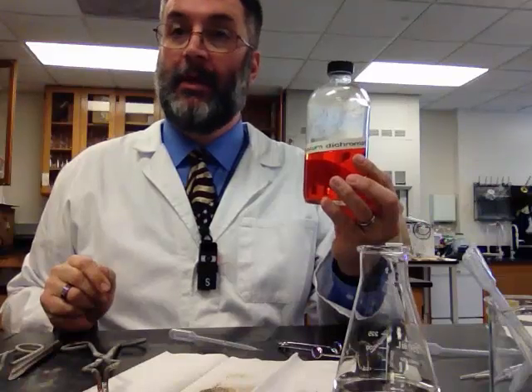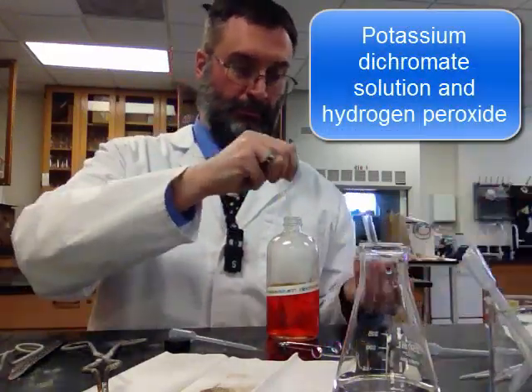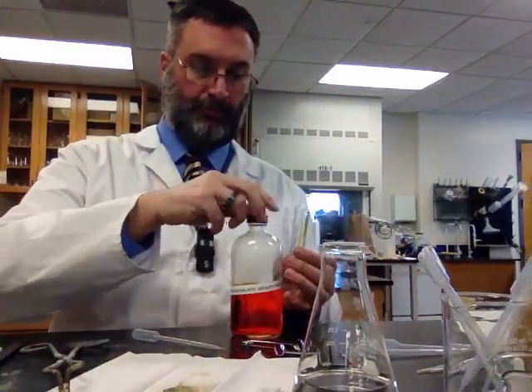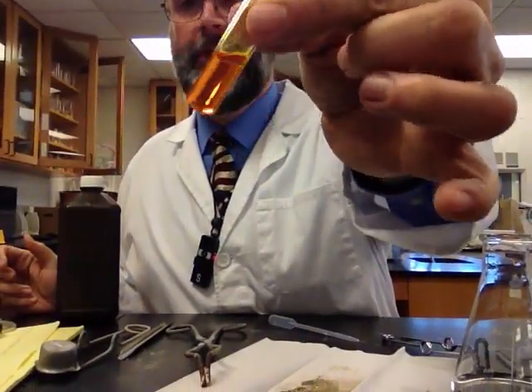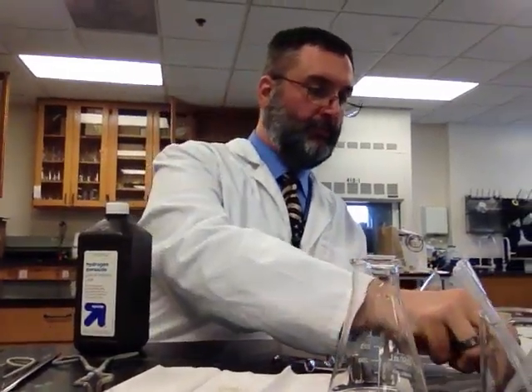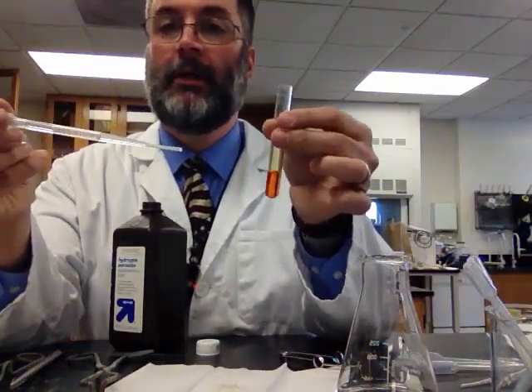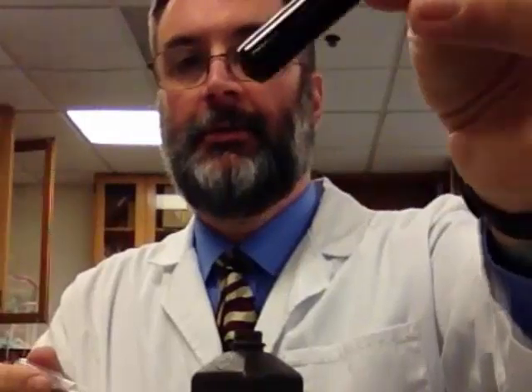Next one. This is potassium dichromate. Potassium dichromate is an orange-colored clear solution. You can see through it. It's transparent, but it is orange in color. You should know what this is: hydrogen peroxide. Hydrogen peroxide is clear and colorless. Here's our orange solution. Pretty clear color change. Matter of fact, all of that orange color is now gone.